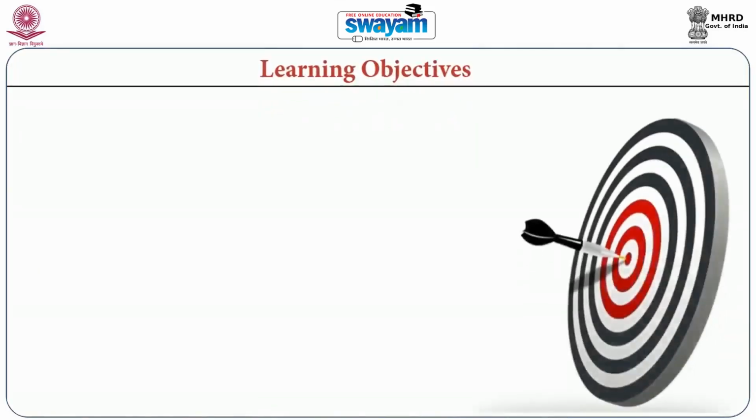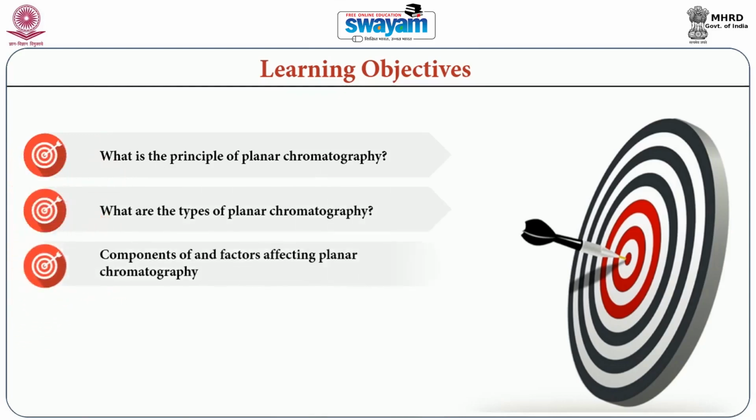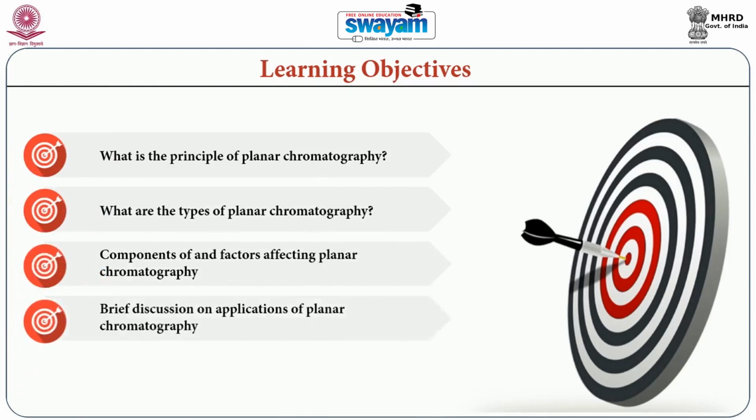So the objectives of this class is to explain the principle of what we shall discuss as planar chromatography, the types of planar chromatography, the components of and the factors that affect the planar chromatographic process, and it will end with a brief discussion on the applications of planar chromatography.